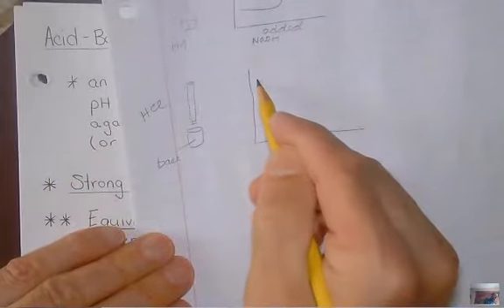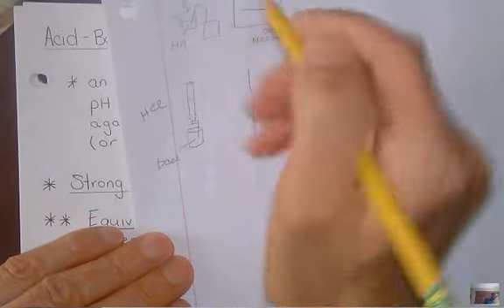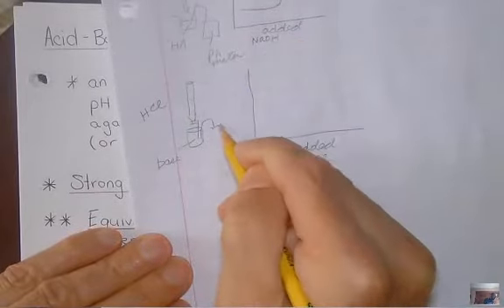Well, what would we expect in this case? Well, a base, before, if I was measuring the pH, I've got a pH electrode in here. Let's go into the pH meter. Same thing over here. Go into the pH meter.